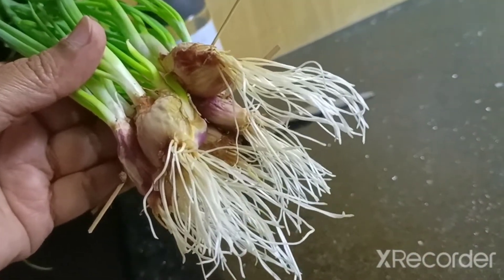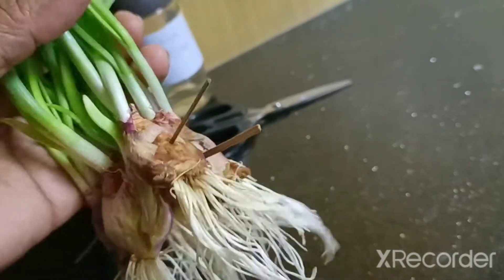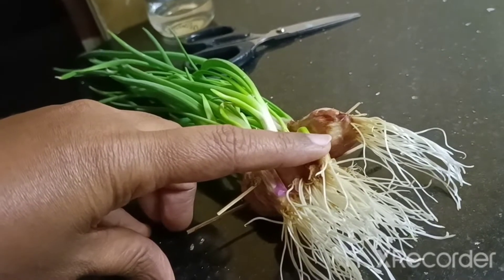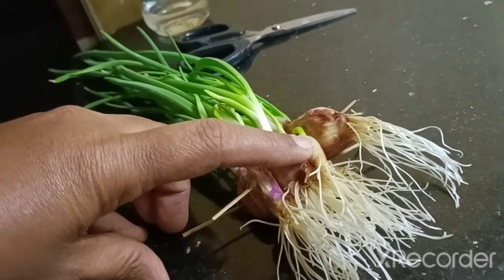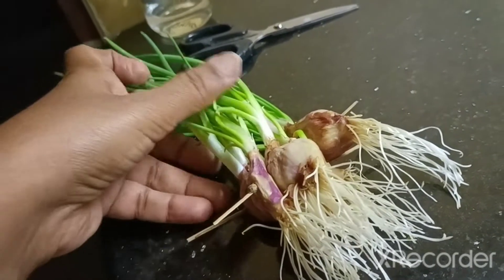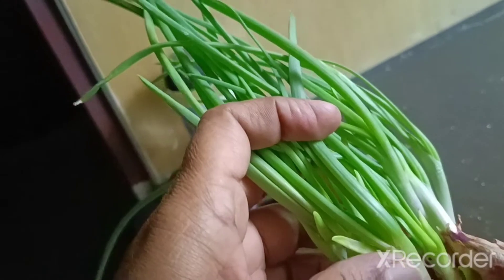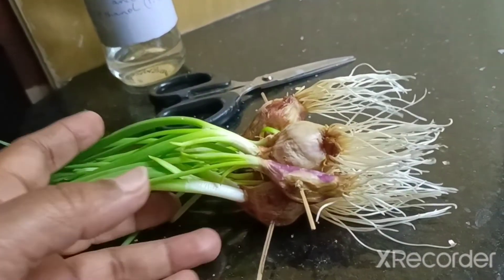I have taken a medium-sized onion. The tip had been trimmed off before keeping in water, and the old root was removed with help of a sharp blade. It was then kept in water with only the base touching the water, in a bottle or beaker. After about one week, the roots have grown — you can see the shoots have also grown up.